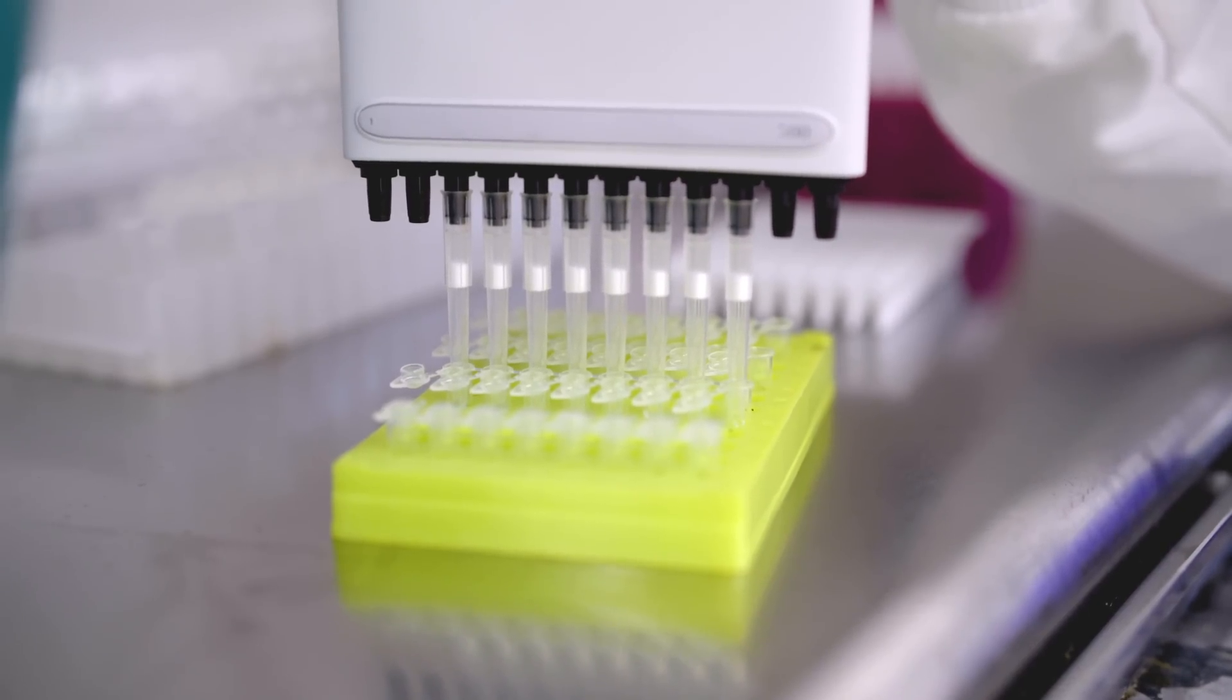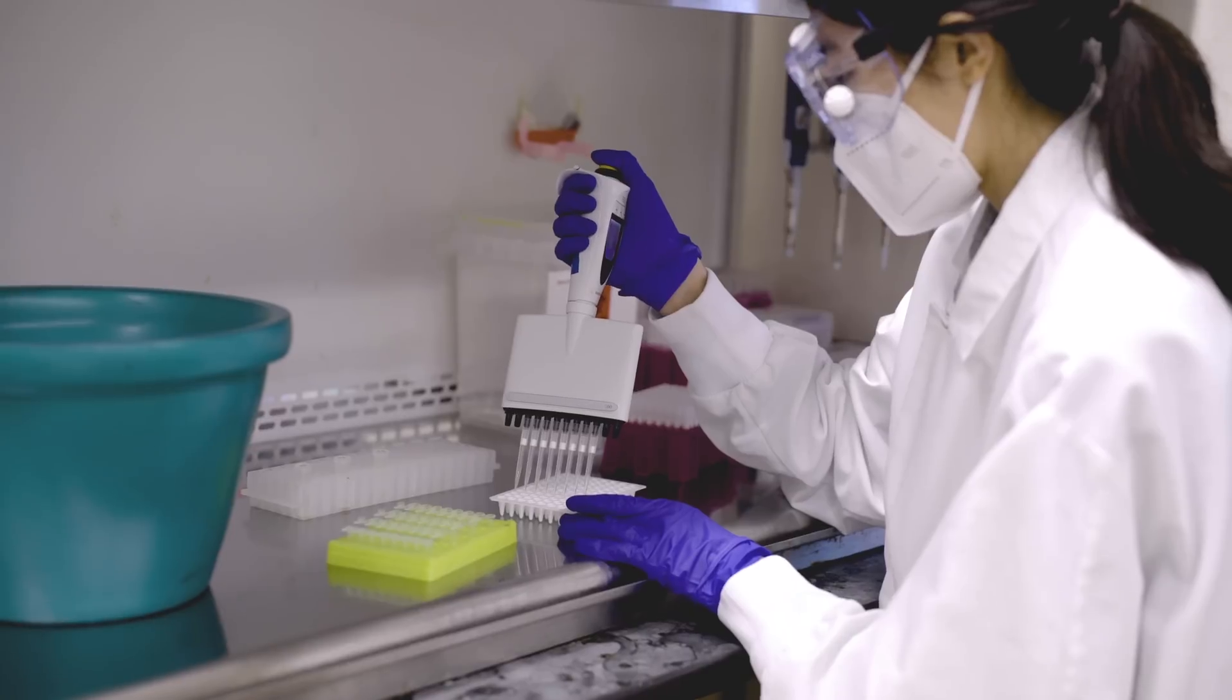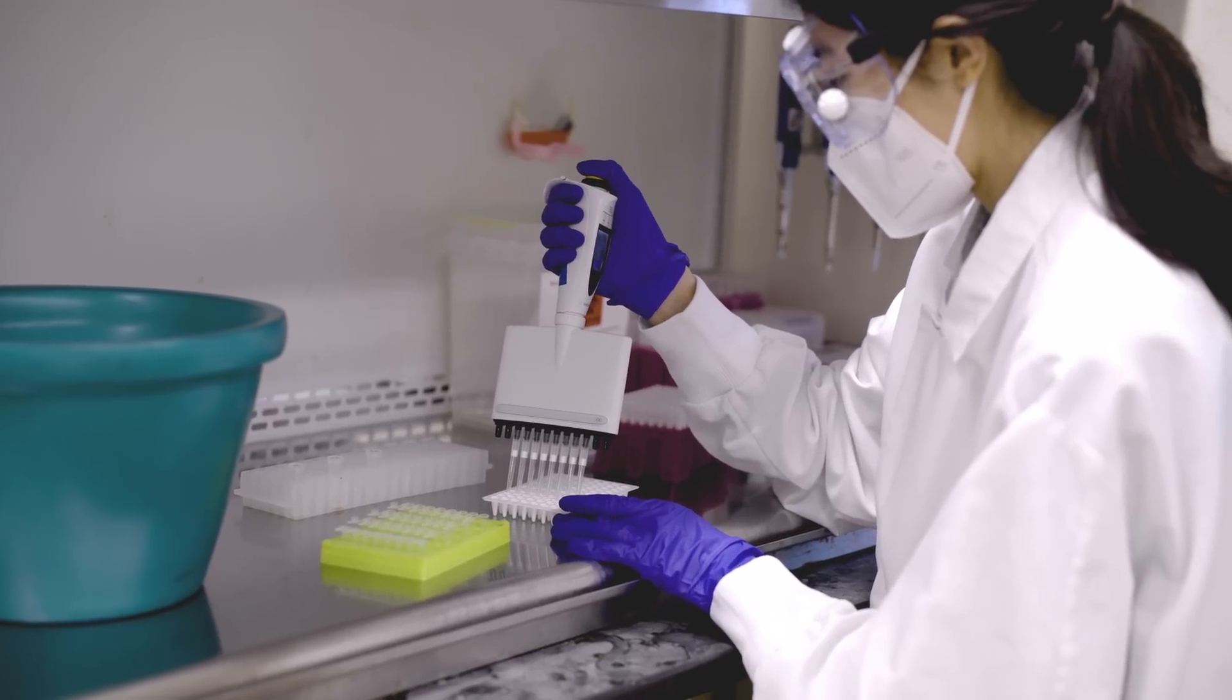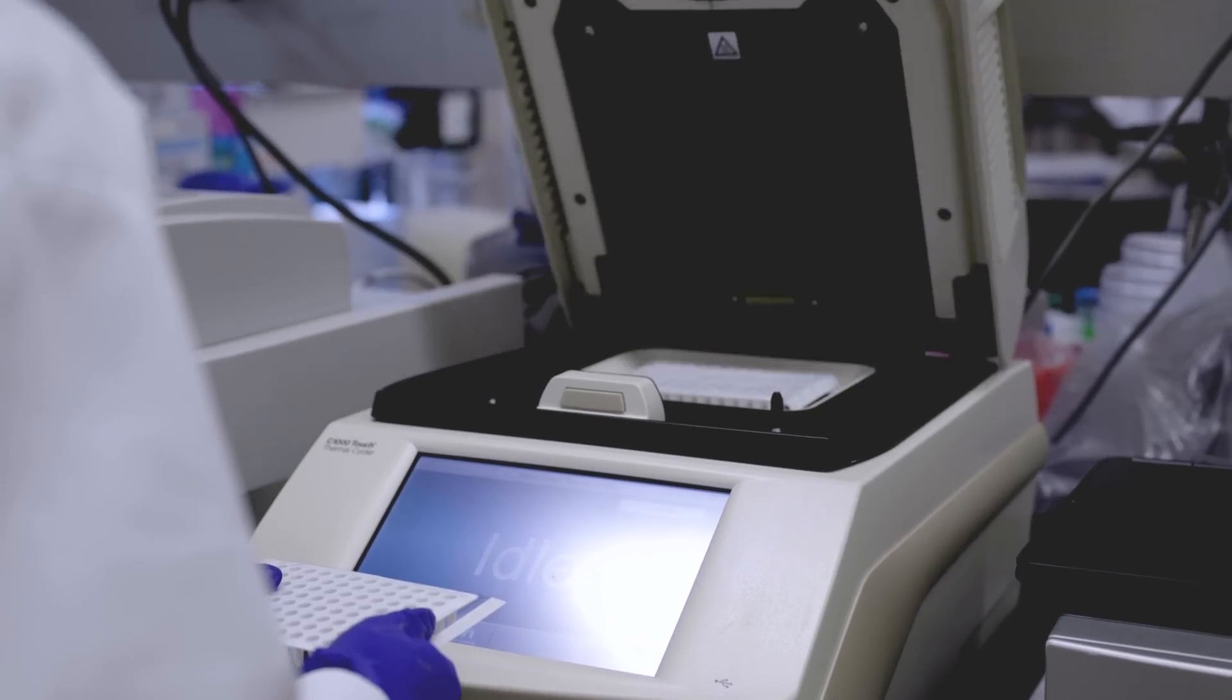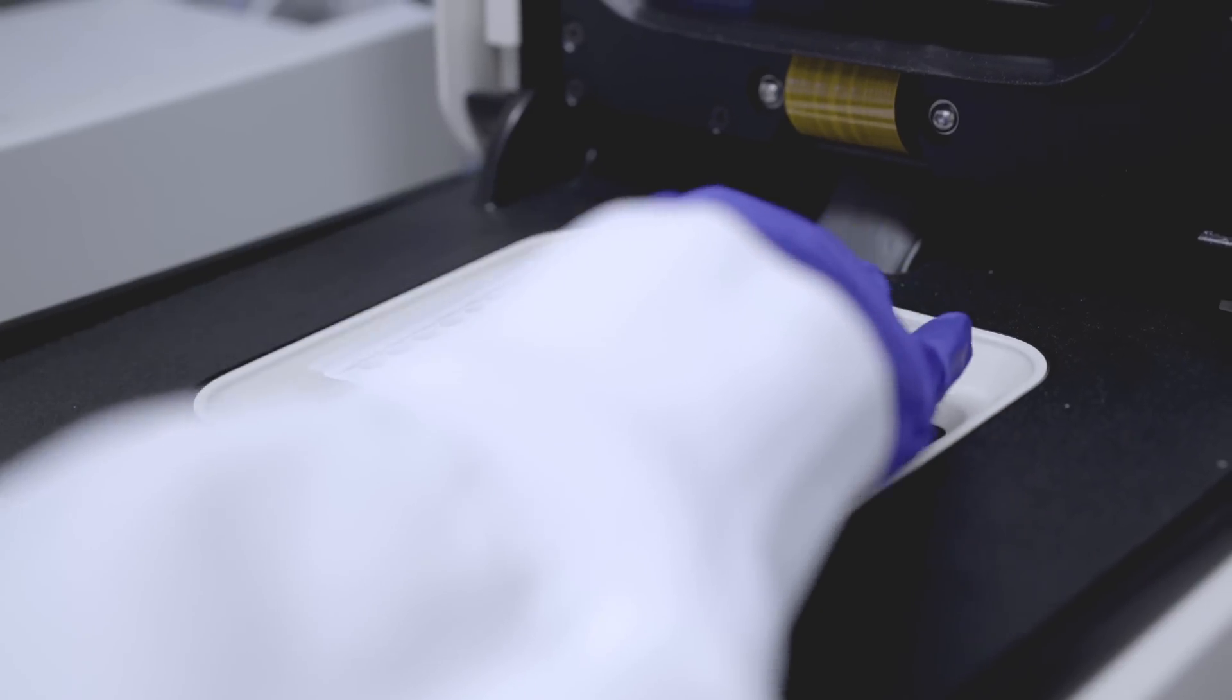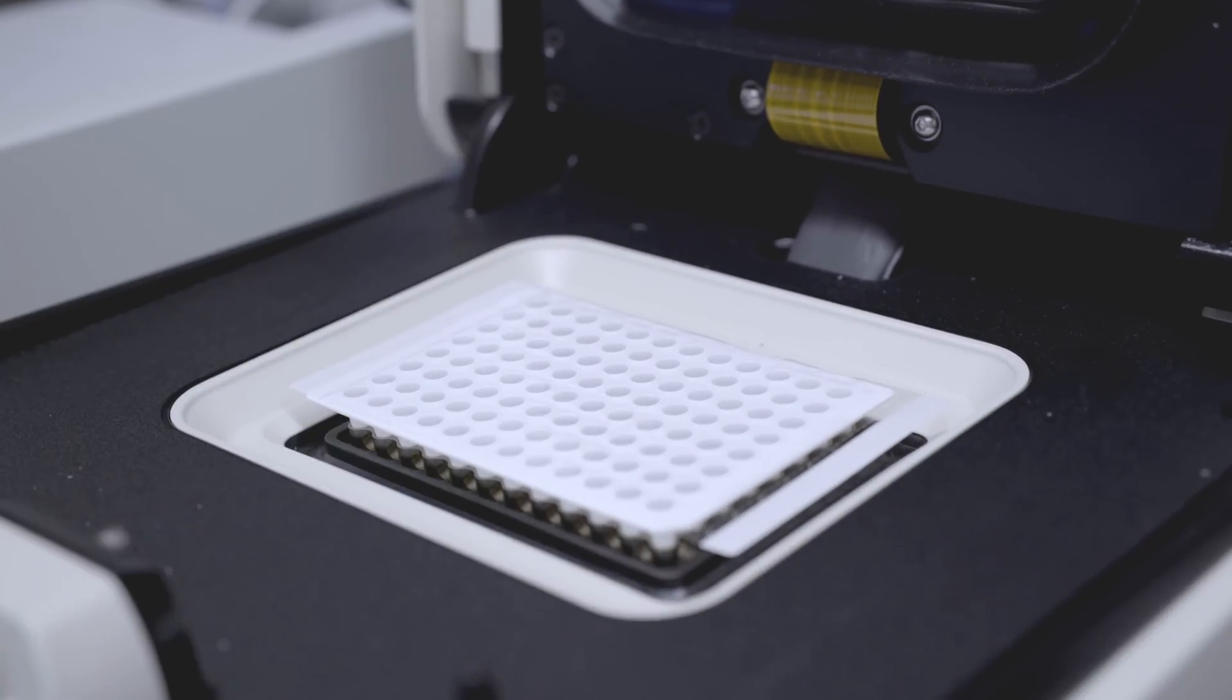After that, it's basically the same thing as the CDC swab test where we do a PCR and that will tell us if the virus is in the wastewater and if so, how many viruses were in there.